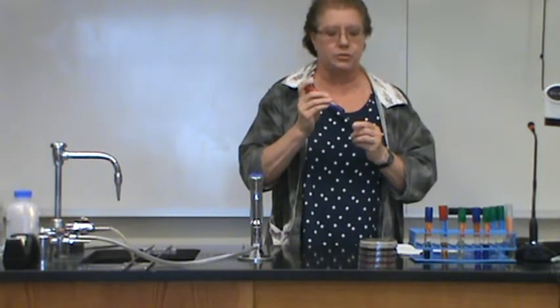They are all a purple broth. This purple broth contains the sugar, and also contains a pH indicator that will turn yellow if this broth turns acidic. So if the bacteria can ferment the carbohydrate that's in there, for instance, this is a glucose broth, if it can ferment glucose, it will create an acidic environment and turn this broth yellow. So we have a glucose broth, we have a mannitol broth, and we have a lactose broth.